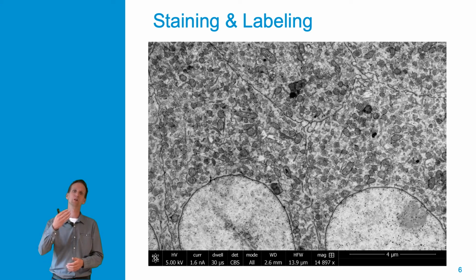But we can also do this after this whole procedure, but then the sample may be slightly etched in order to remove the upper layer of polymer. And of course, in this case, we may be limited because some of the epitope may have been lost by the action of the polymers and the stains on the biological material itself.